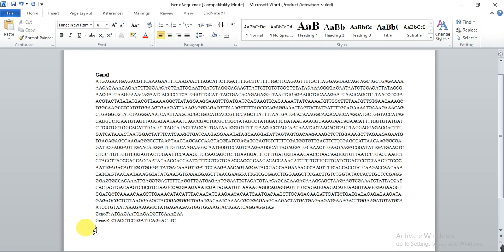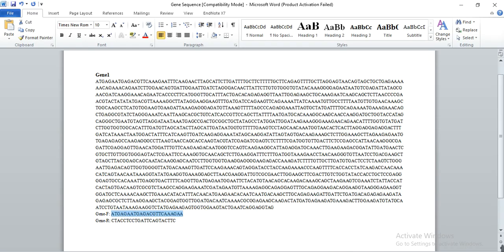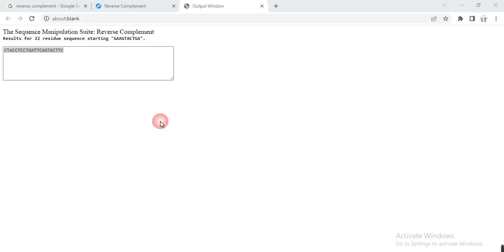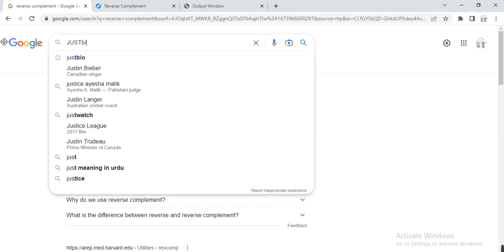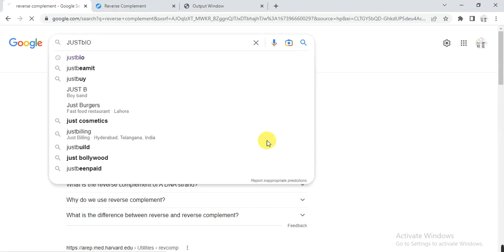Now we have to calculate or analyze these primers - what are the melting point, what are the length, what are the GC content, and are they okay or we have to edit or beautify them. So copy this, then go to Google and write here JustBio.